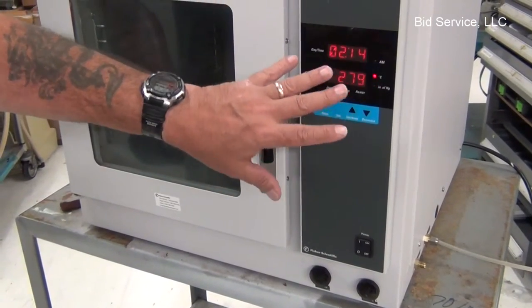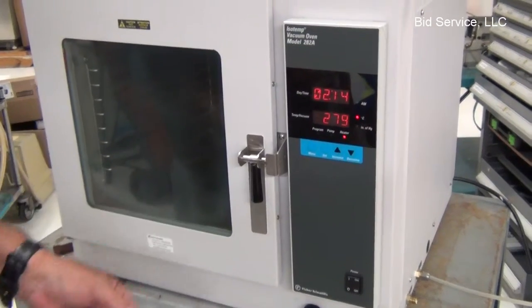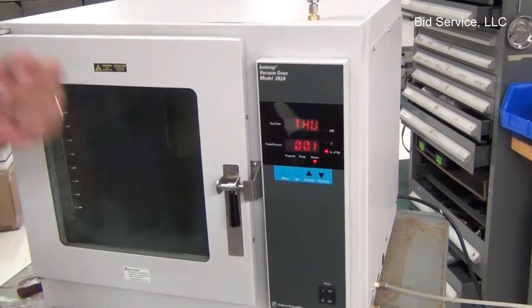If you set the date, it does have a programming ability to go through the entire week at different ranges, whatever you set into it.